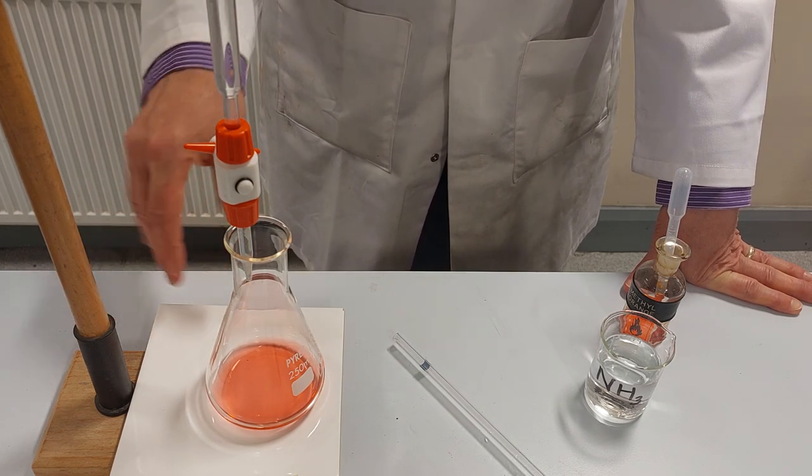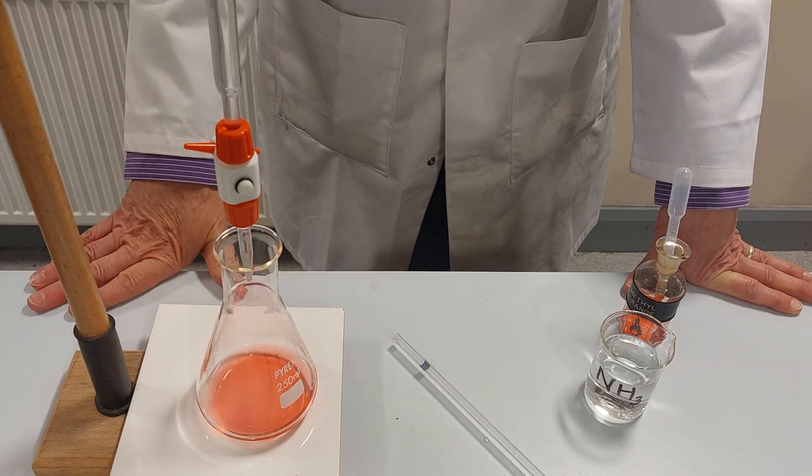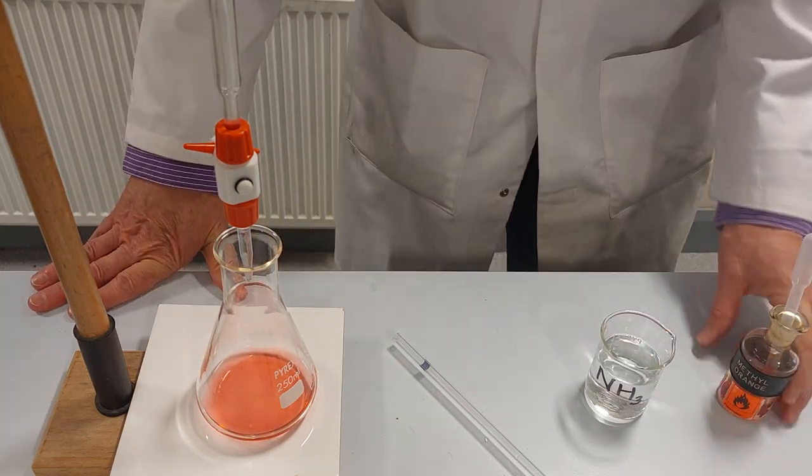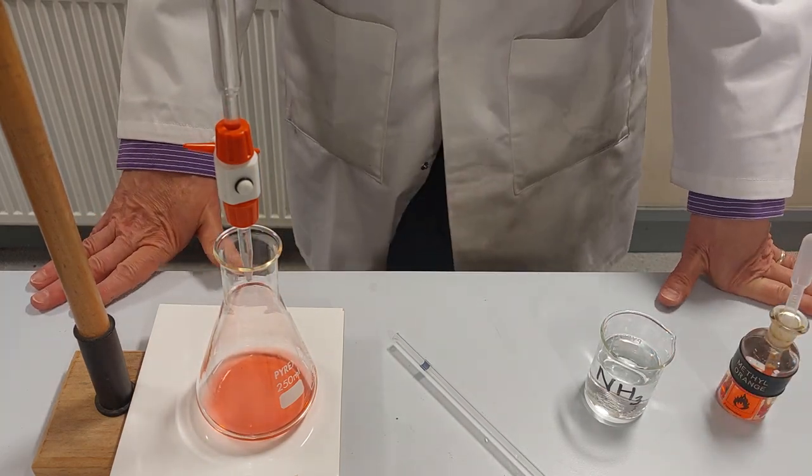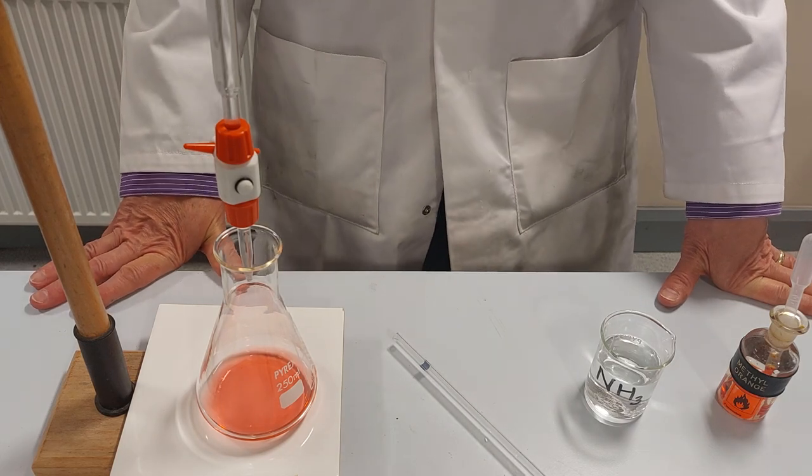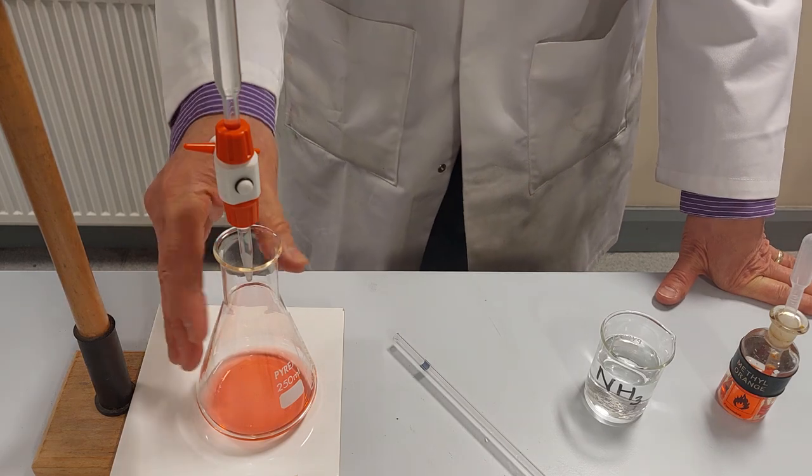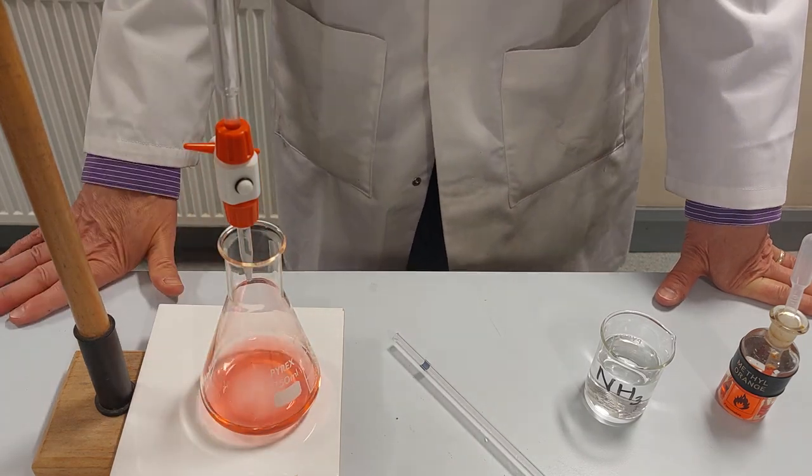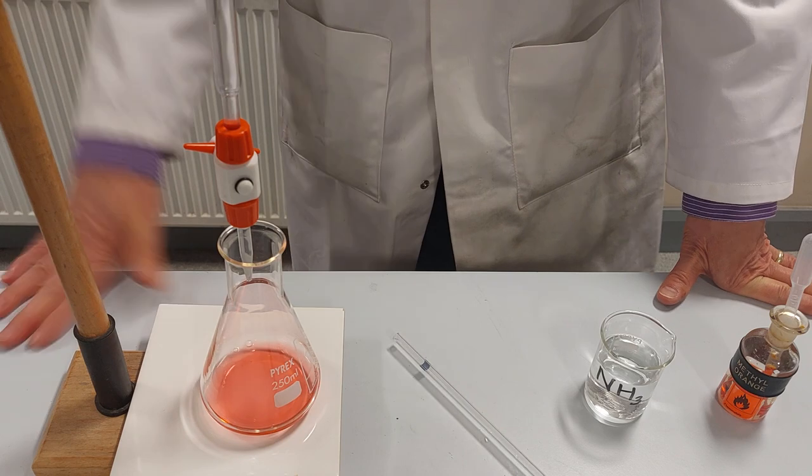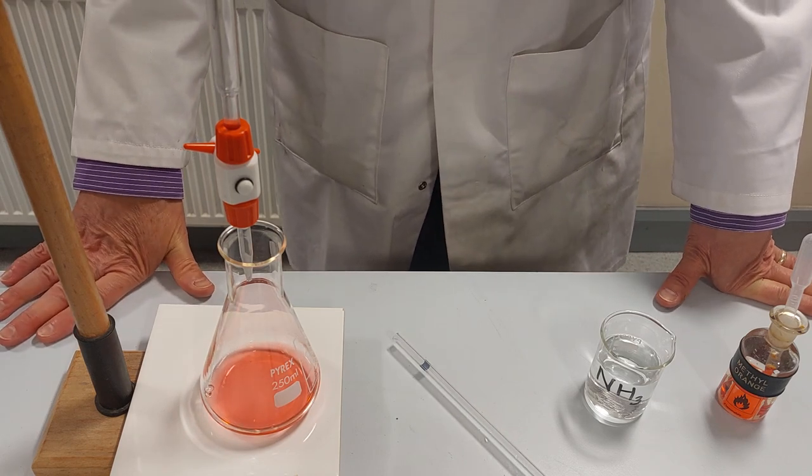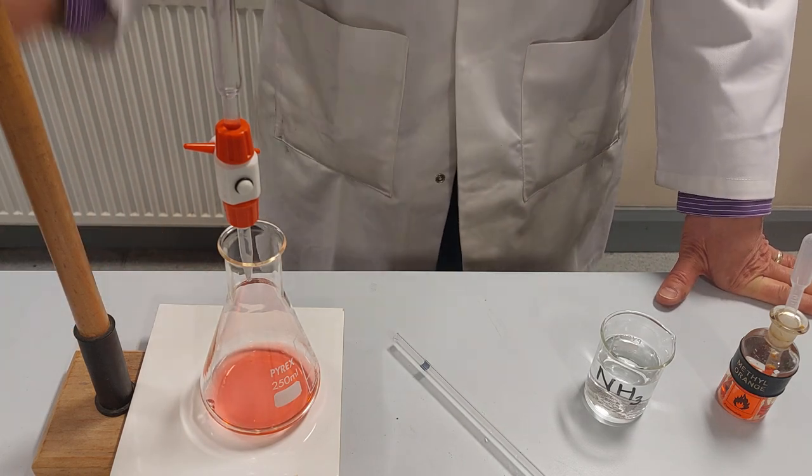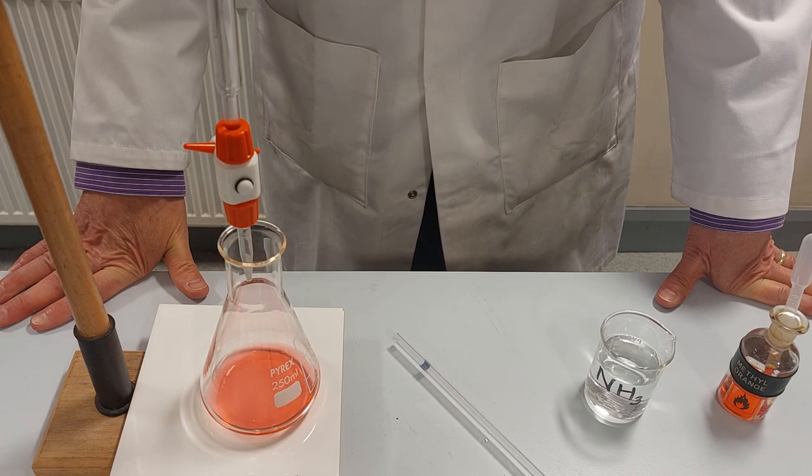That's gone after only four centimeters cubed. Okay so four centimeters cubed of acid gave me a color change there with the indicator. I thought the acid was about one mole per dm cubed but we'll find out what it is in a moment. We'll do a calculation. Okay so that's how we do a titration. I'll take a reading from the burette and that tells me the volume of acid that I've added.